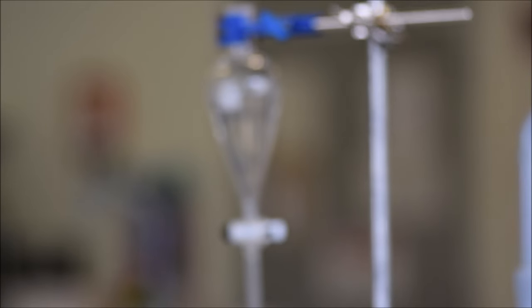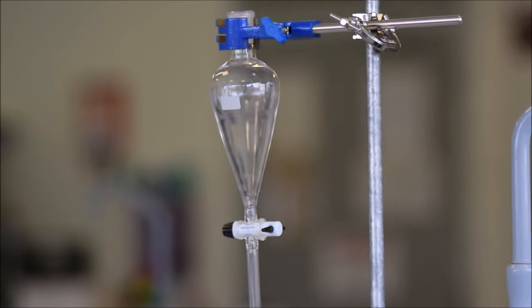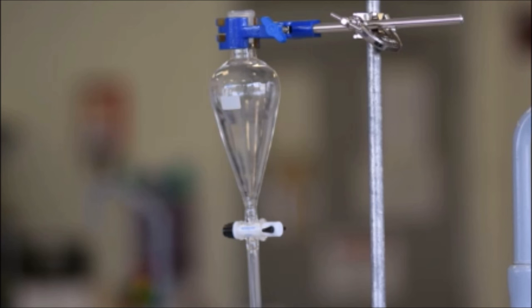Okay, today we're going to learn to use the separating funnel. The separating funnel is another essential piece of chemistry glassware. You'll see them in every chemistry lab in the world. First things first, you have to clamp it correctly.